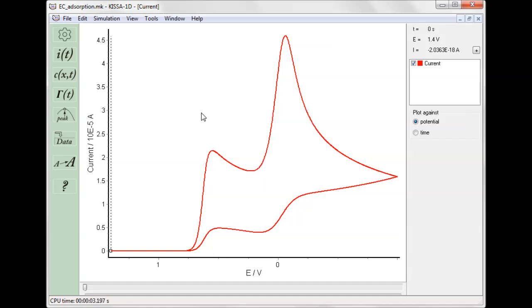The voltammogram displays two peaks, the first of which is due to the reaction proceeding through the adsorbed path, while the second peak is due to dissolved species.